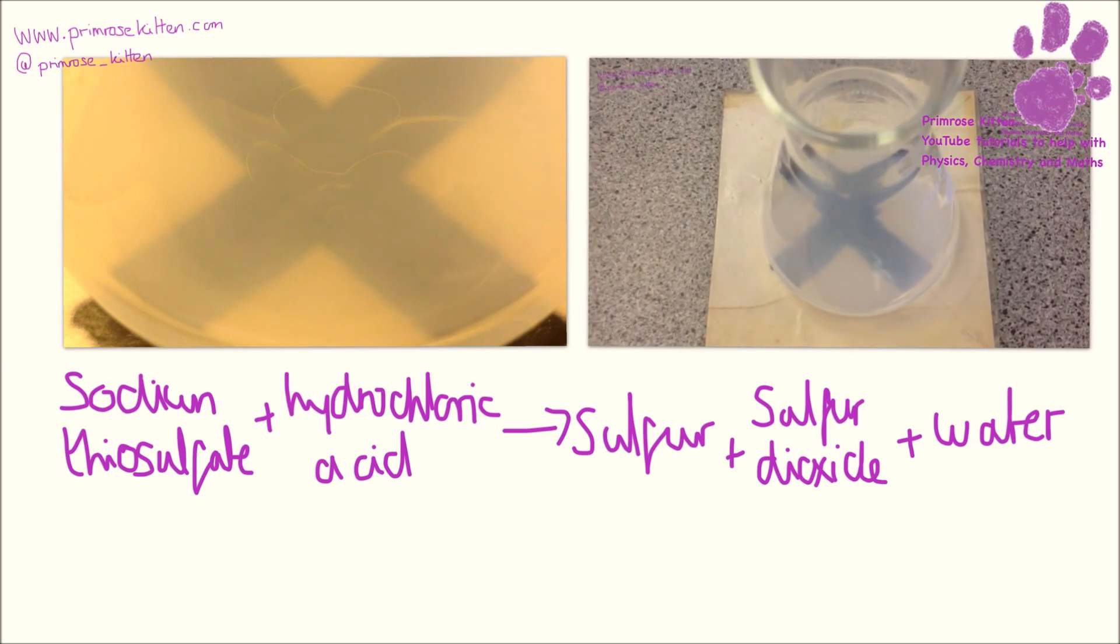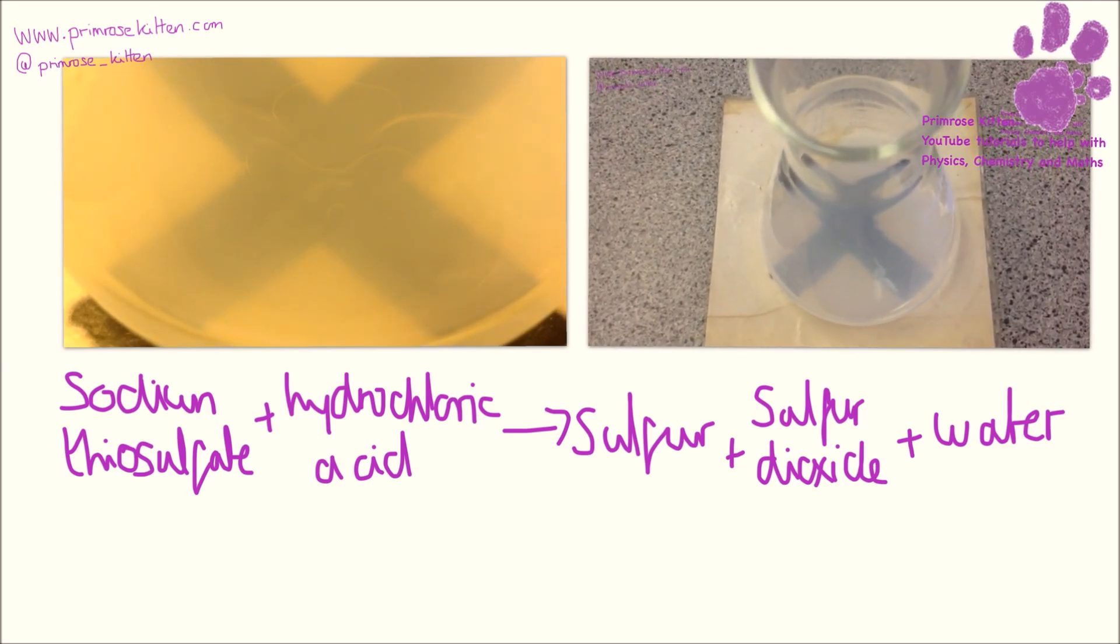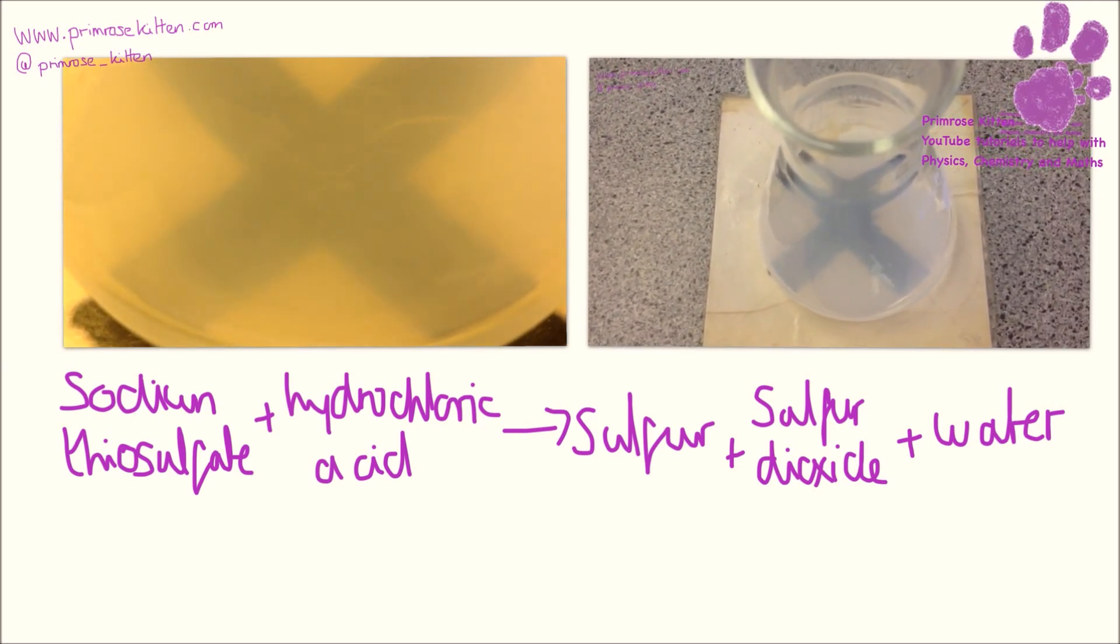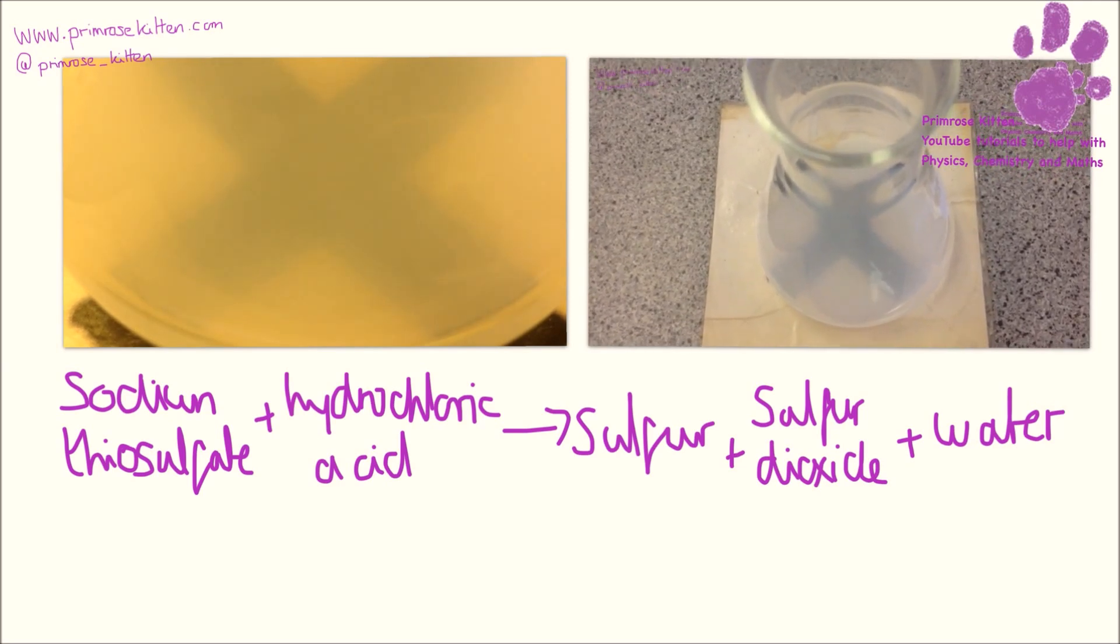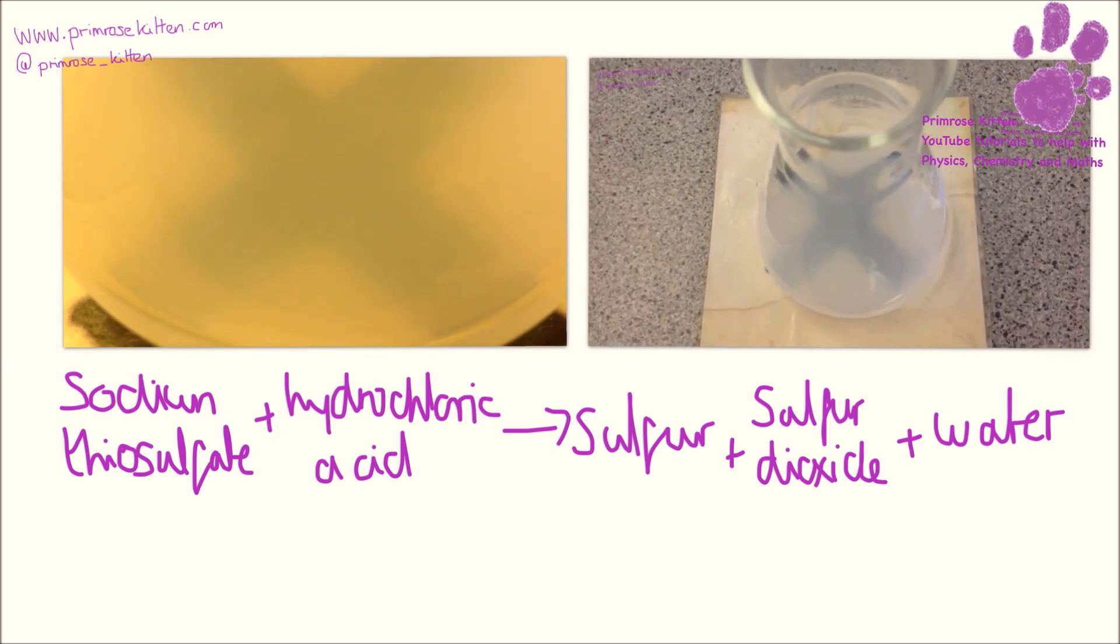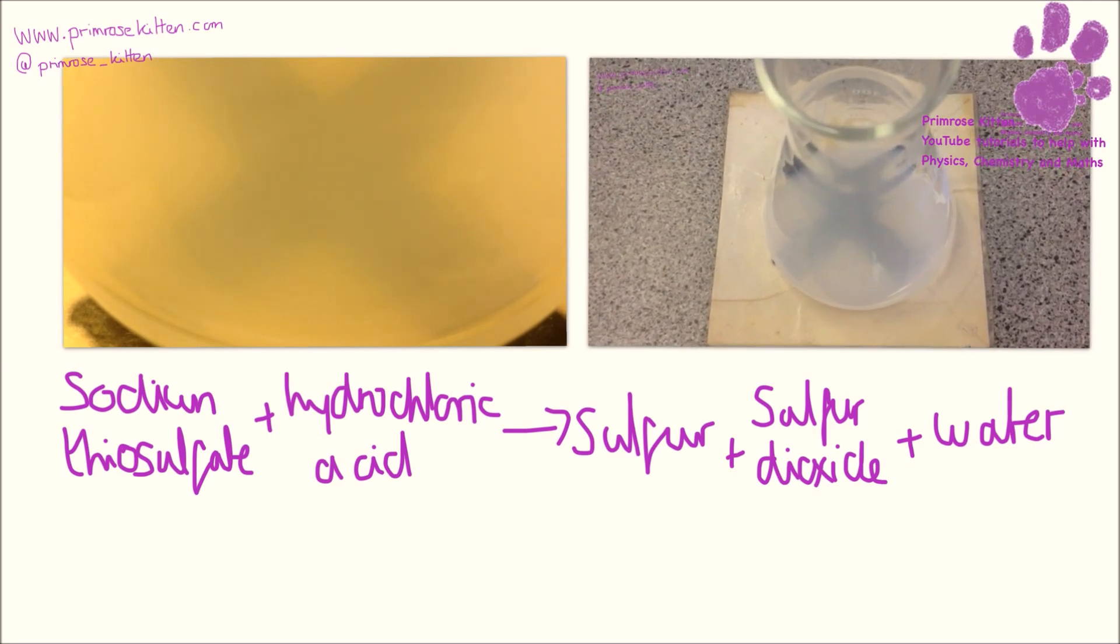This is another way of measuring the rate of reaction. So we know when the reaction is finished when we can't see the cross anymore. That's because loads of sulfur has been produced, which goes cloudy so you can't see the cross on the bottom.